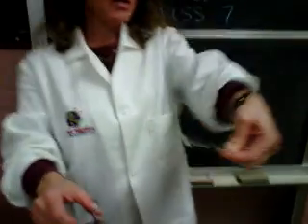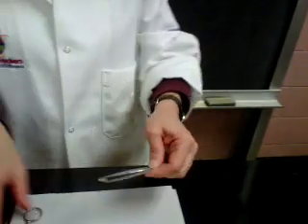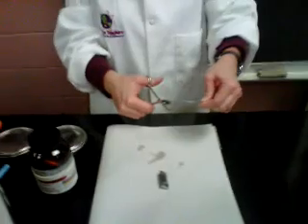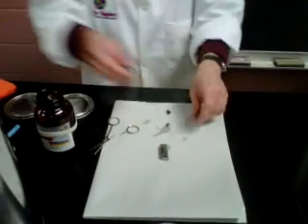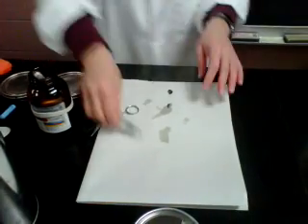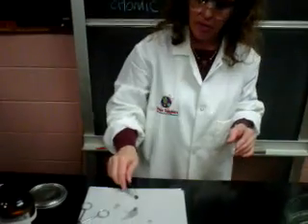Can everybody see? Cody, you need to put them on. Put them over there. Oh, they're over here. Sometimes this thing jumps, and I've seen it. We need to get them another pair, there's a pair right there. Okay. So let's cut it in half, because it's like surgery now. I'm going to put this one away. I'd rather not touch it with my hand.